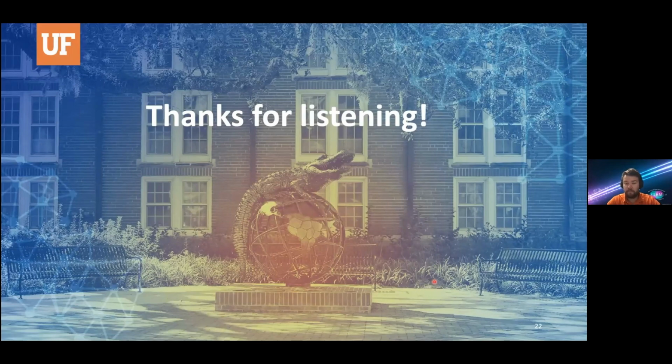Thank you so much. That's an amazing, very fantastic talk. And you have, I must say, a very nice, amazing setup. I just have a question. Do you measure the level of polarization on the carbon or just the hydrogens, right?